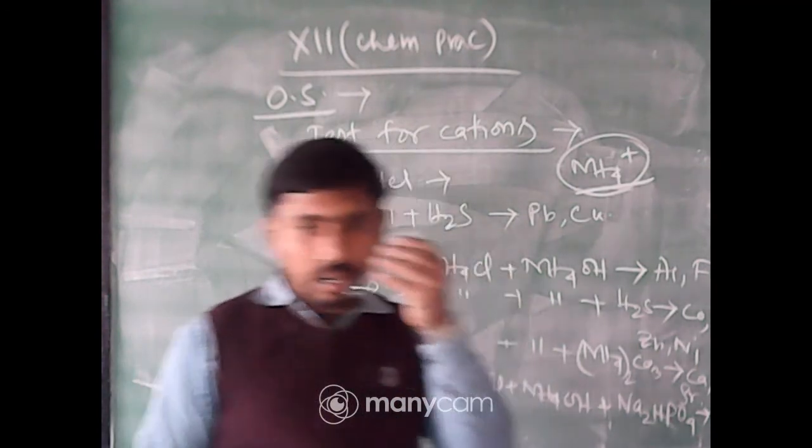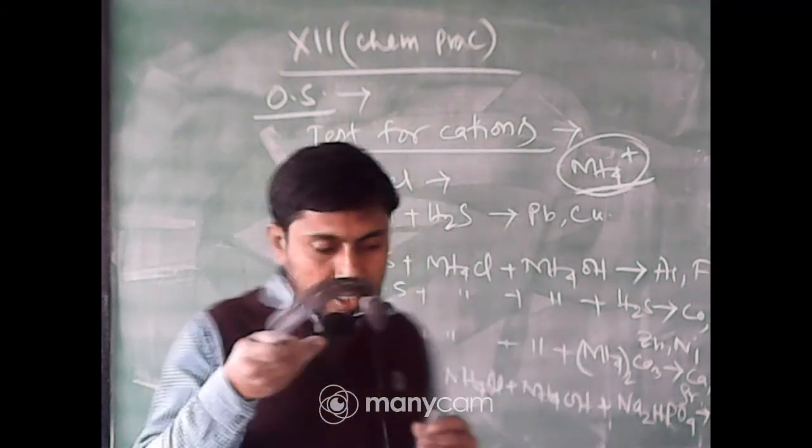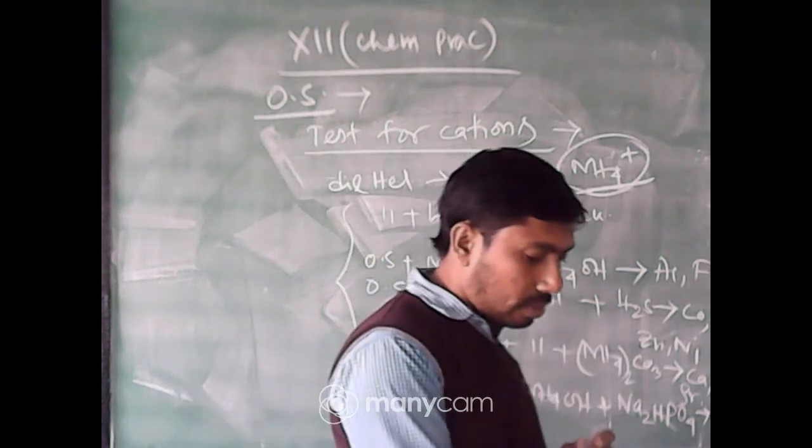Solution is taken, and I will add here NaOH pellet, that is solid sodium hydroxide.